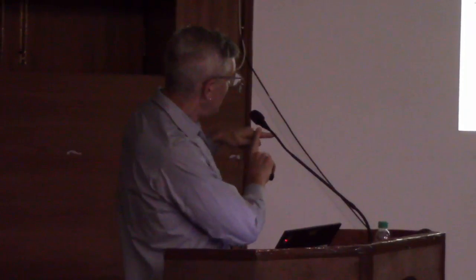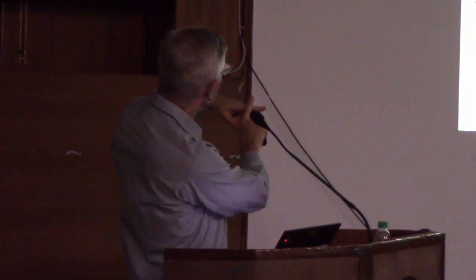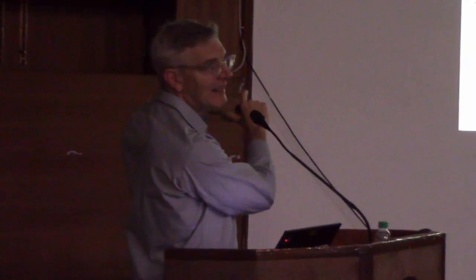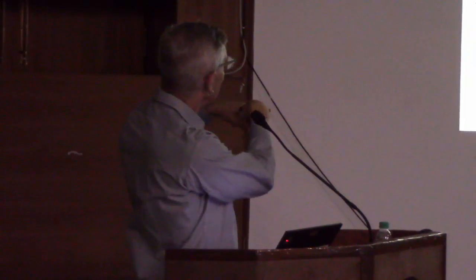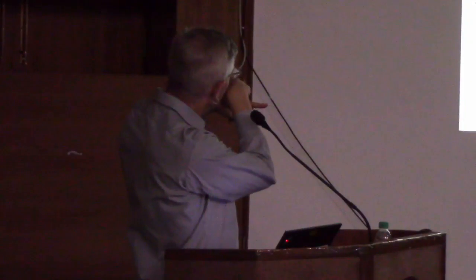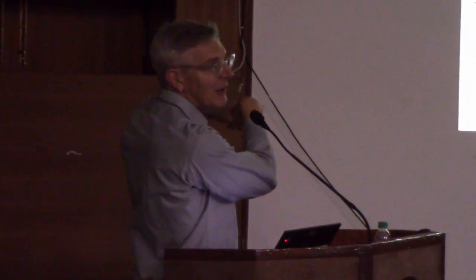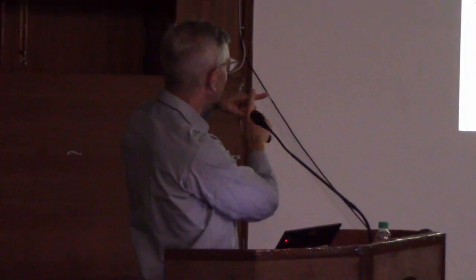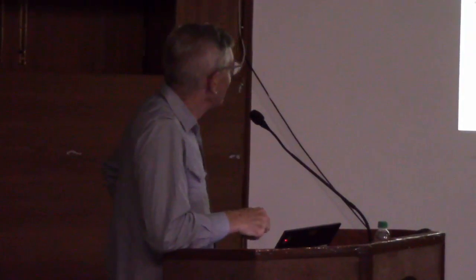If I'm looking at it from this angle and it's oscillating vertically like this, I'll see the whole intensity. But if it's oscillating horizontally, I'm looking along the direction of oscillation, and I see no intensity. So it goes from full intensity at one polarization to no intensity at the other. That's the polarization correction, and we have to correct the intensities for that.